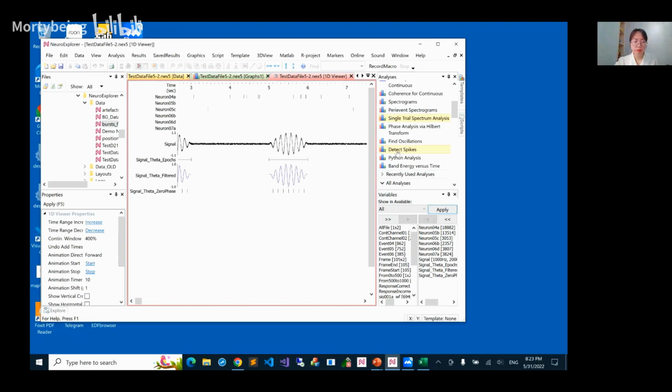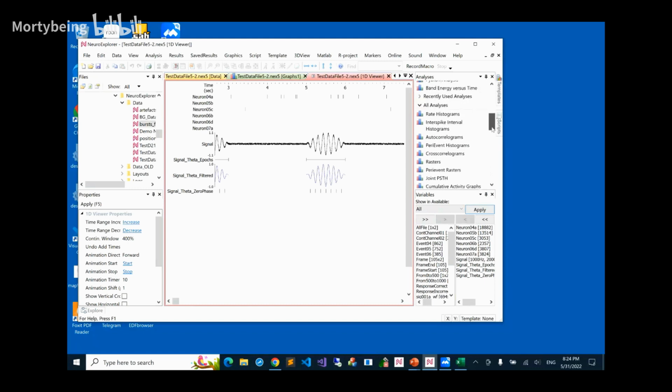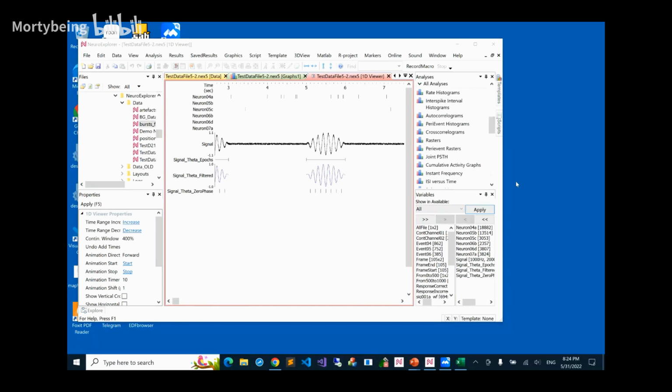Yes, Alex, I would like to ask some general questions regarding NeuroExplorer. So now, how many functions do we have in the analysis? I think it's about 40. 40, right? Yeah, 40. There is a help function in the software. Can we find the description for each function there? Yeah, you can also do this with online help, like documentation.